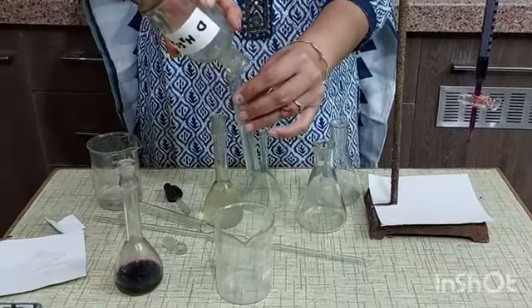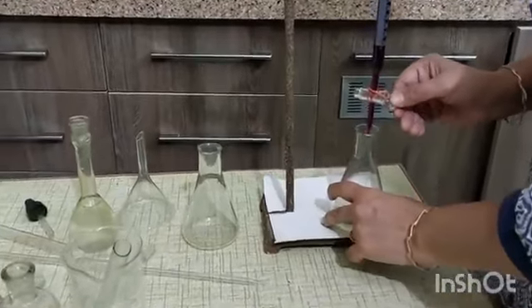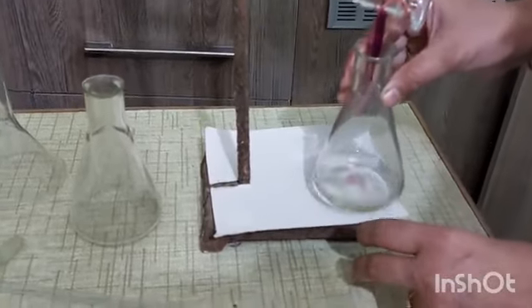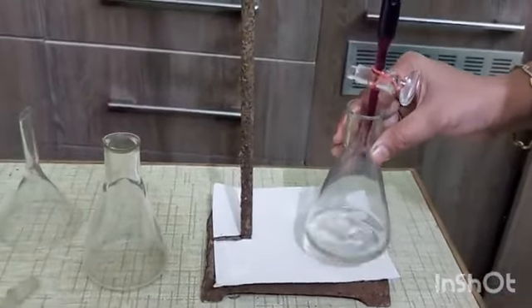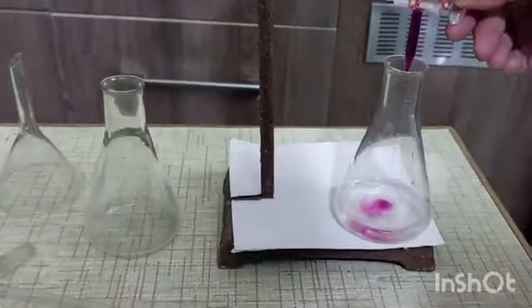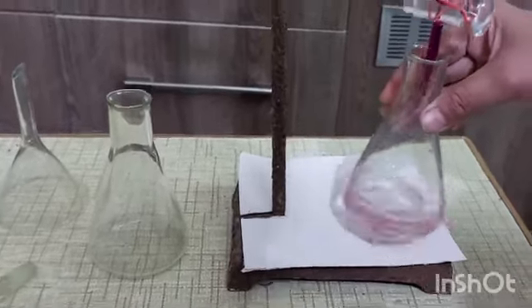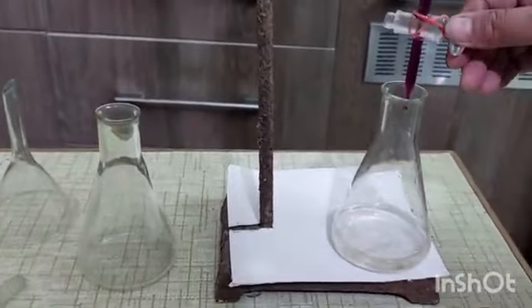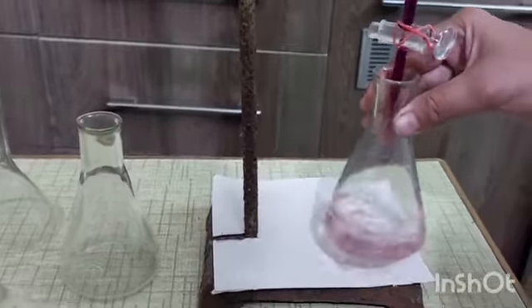Now titrate this reaction mixture with KMnO4 solution. Add KMnO4 solution from the burette drop by drop until this transparent color changes into light pink color.